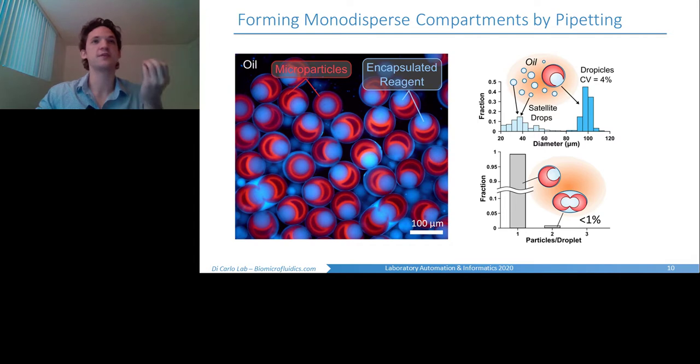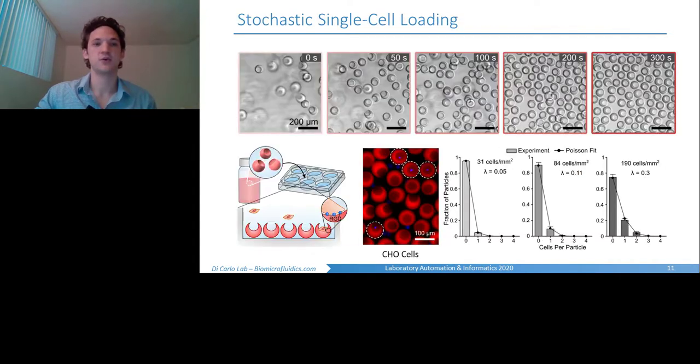So how can we associate cells with these? One thing we notice when working with these particles is that if you seed them into a well plate, you can imagine that due to their morphology, they actually tend to settle with their cavities exposed upright. So exploiting this effect, what we found we could do is seed the particles into just a normal well plate. Once they have settled and reached the bottom of the well plate, you can then seed cells in. In this case, we have particles that are modified with an integrin binding peptide sequence, RGD. We're using CHO cells as a test line.